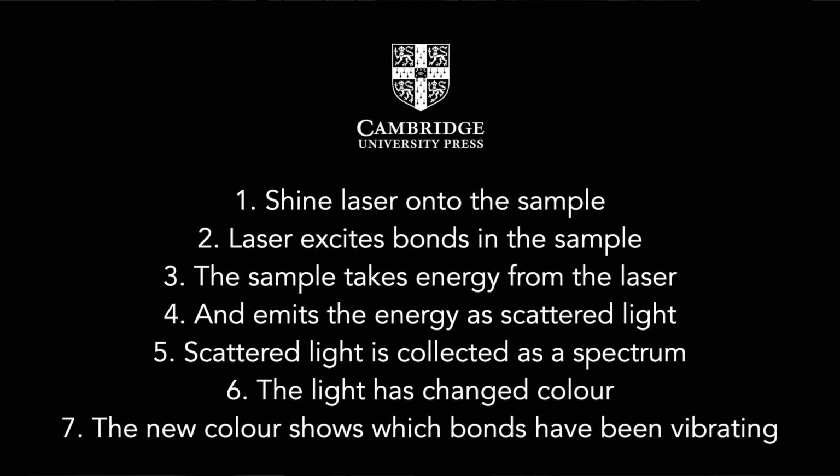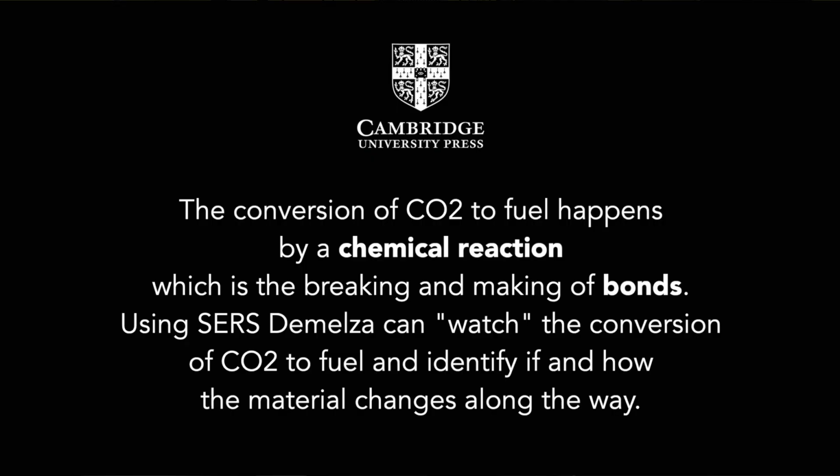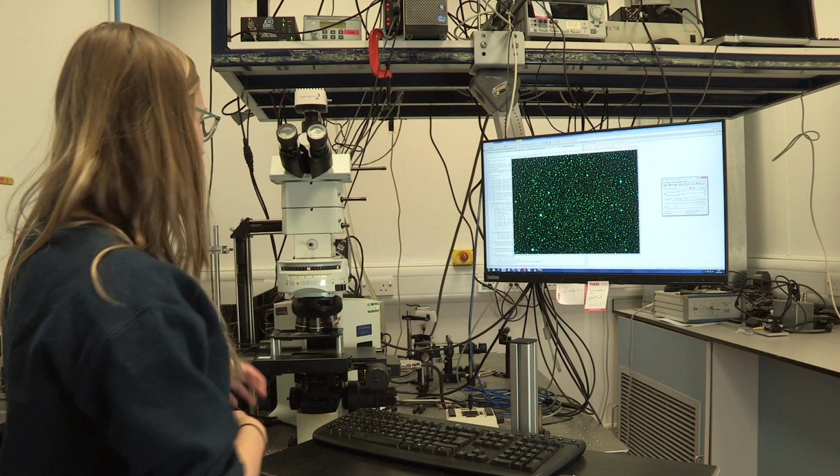That's really useful when you're trying to look at chemistry, because chemistry is breaking and making bonds. So breaking and making bonds, and I can tell which bonds are in it. Great, cool, I can tell what chemistry is going on. So that's what you're looking at right now.